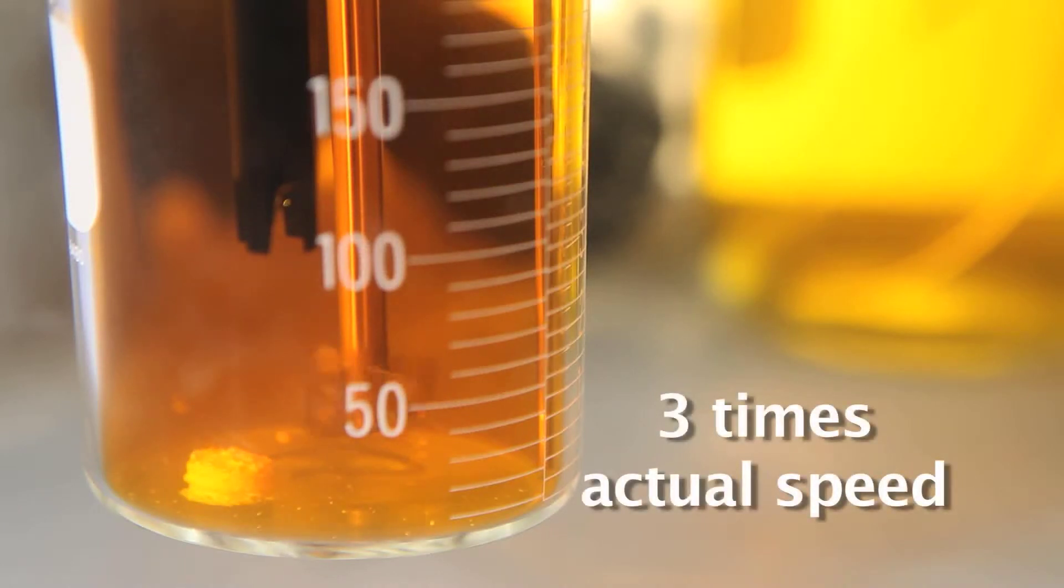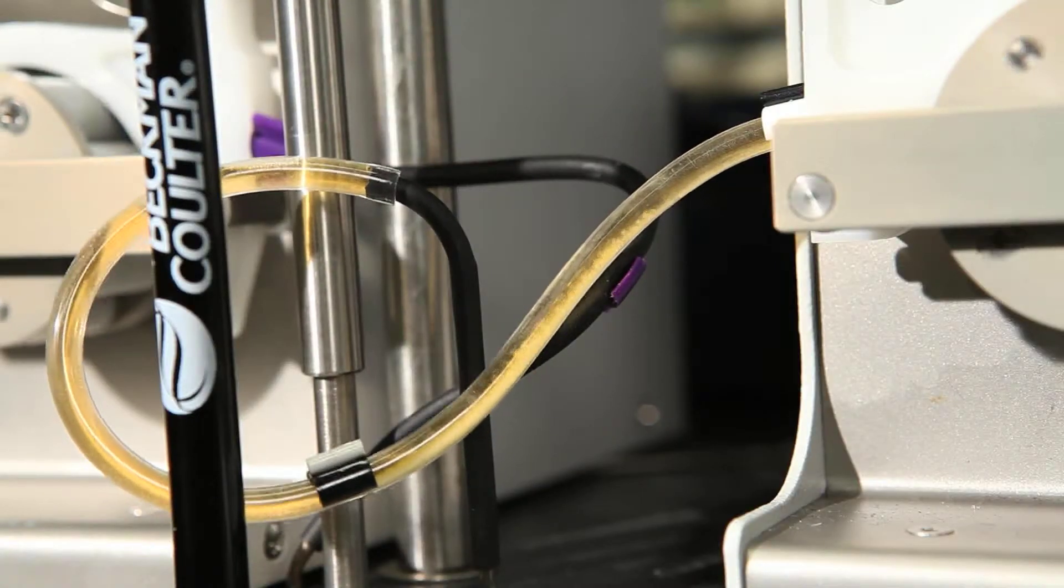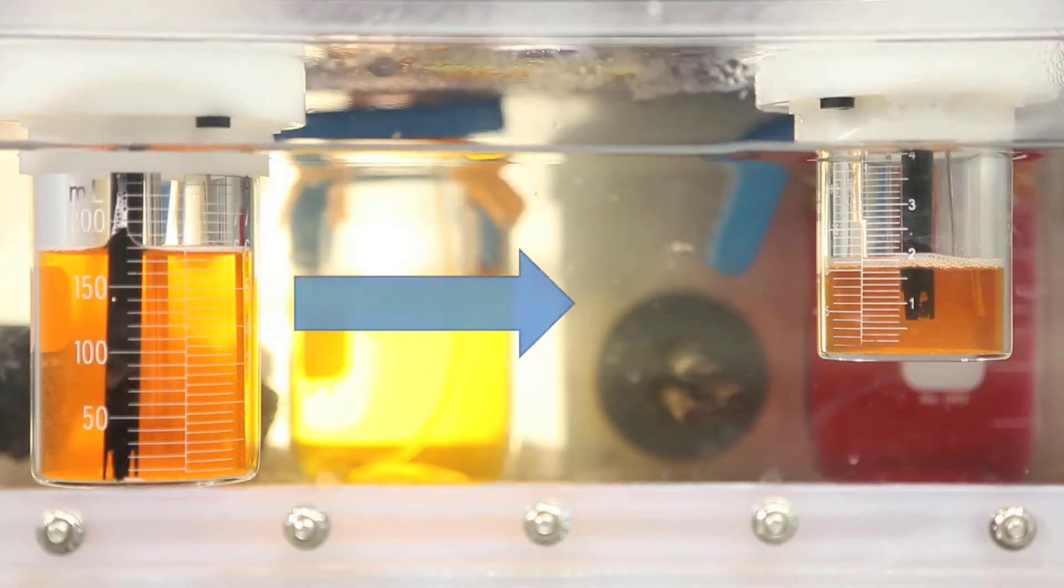The drug product typically begins disintegrating and dissolving in the gastric chamber. Stomach fluid, as well as dissolved drug, solid drug particles and excipients present in the gastric chamber are transferred to the duodenal chamber in a first-order manner, typical of humans.